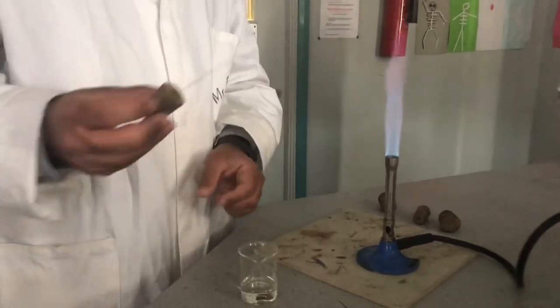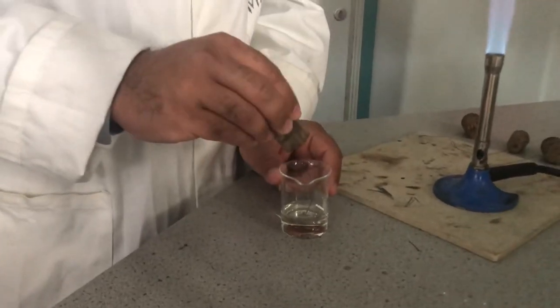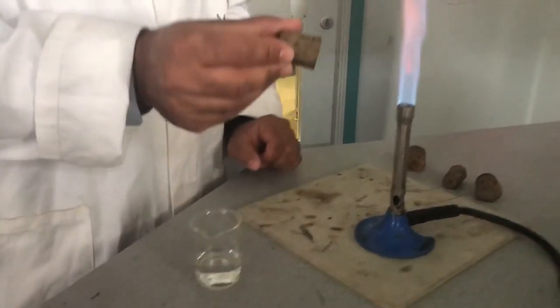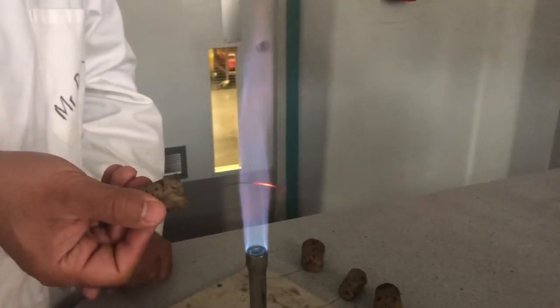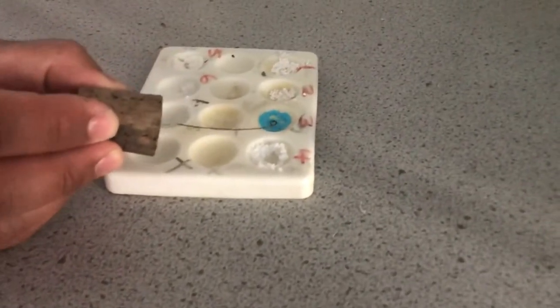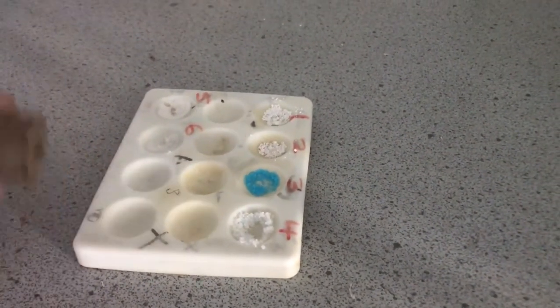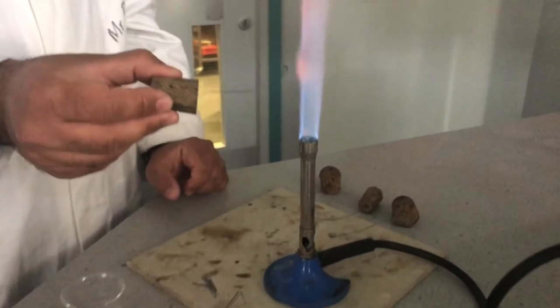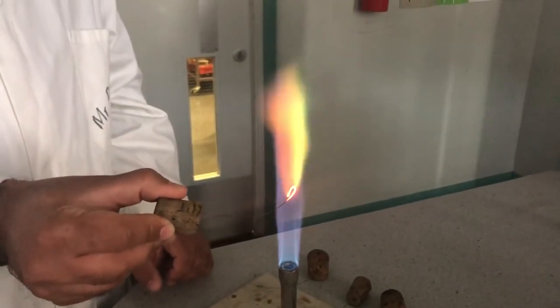This is my nichrome wire. Usually we clean them. These have all been cleaned previously, but just to demonstrate how we clean them, we use a little bit of acid and place it in the flame, just to make sure that there's no existing color. That's now clean. And I'm going to place it in my first compound. And just observe what color it gives me. As you can see, it's giving a turquoise color.